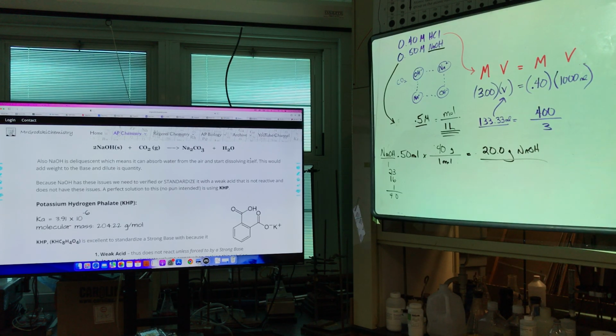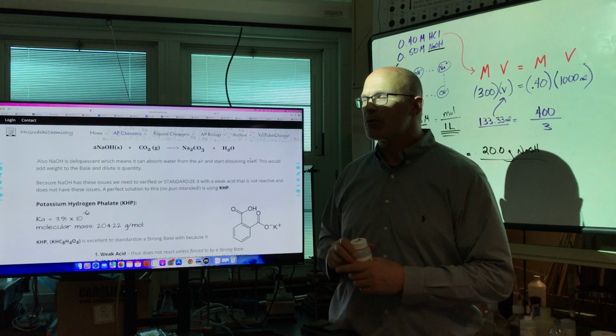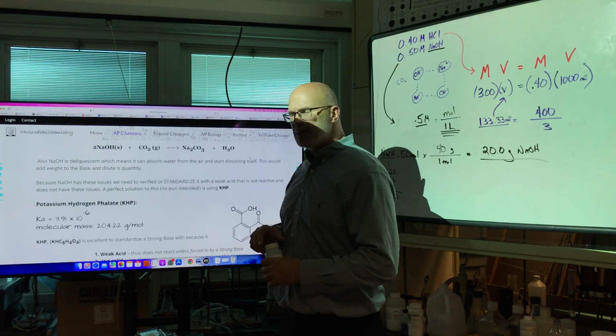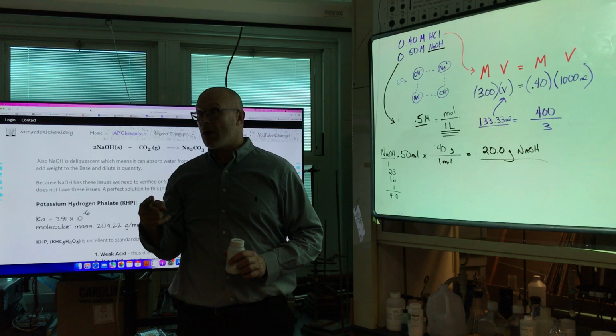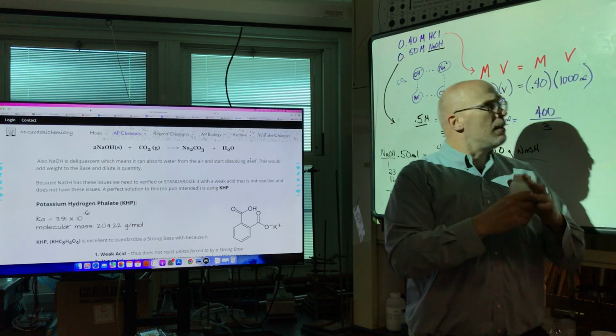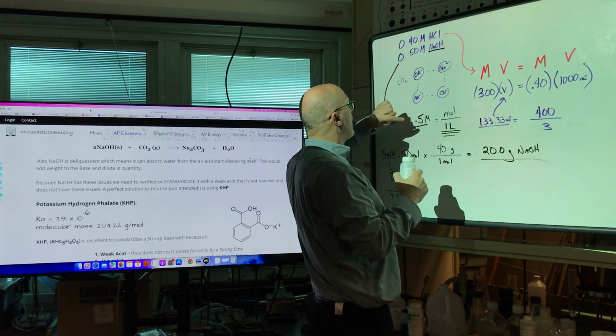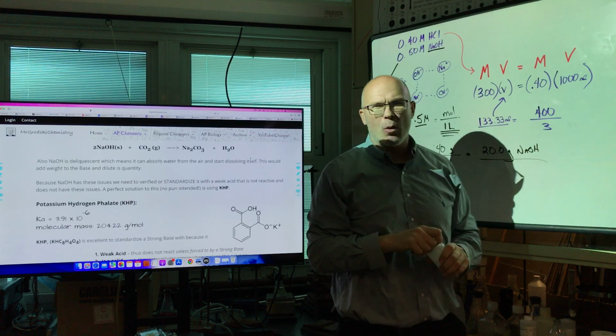Okay? And I want to show you something. I put a sodium hydroxide pellet in the air today. I'm going to put it on the screen here. And what I did is, sodium hydroxide is also hygroscopic. What that means is not only will it attract CO2, it'll attract water in the air. Water vapor, or gas, will arbitrarily hit this hydroxide, and it'll absorb it into the crystal and make it a kind of wet hydrate.